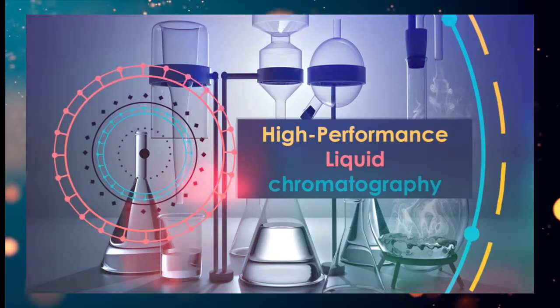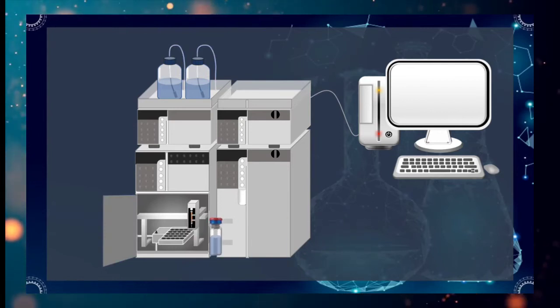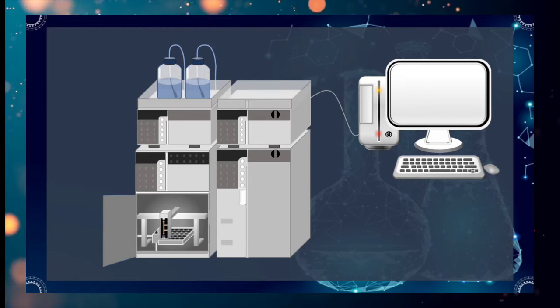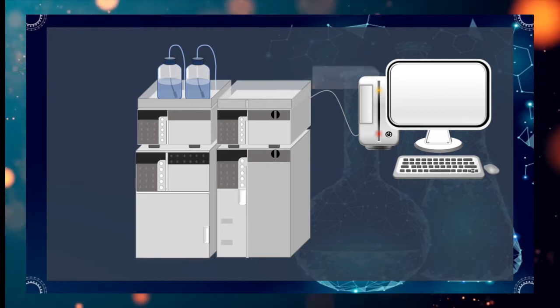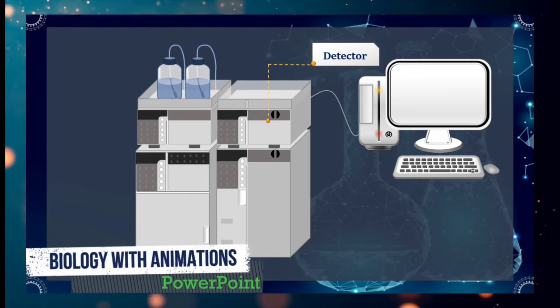Okay, now guys, this is high performance liquid chromatography. This is a small and quick animation of HPLC separating each component from the unknown compound in real life.